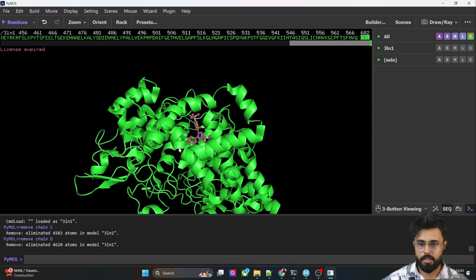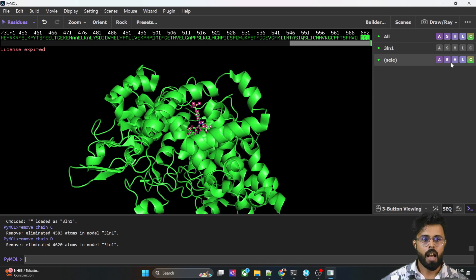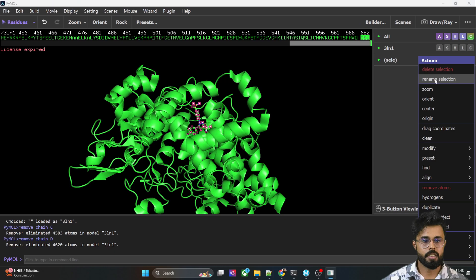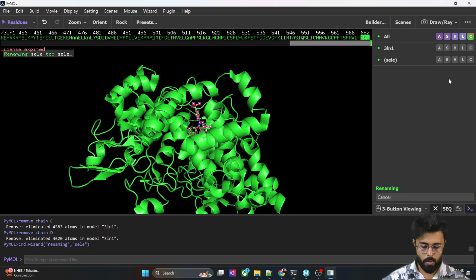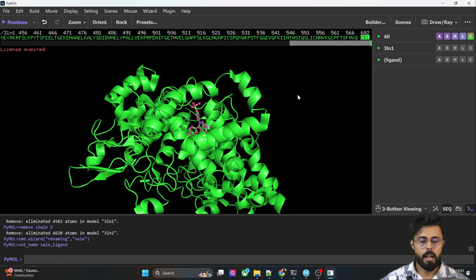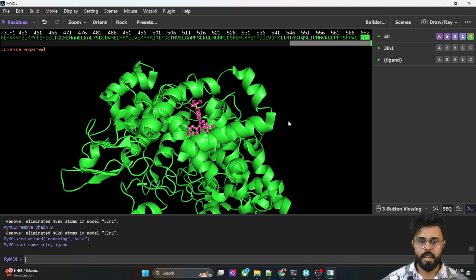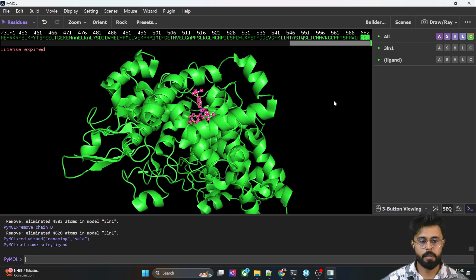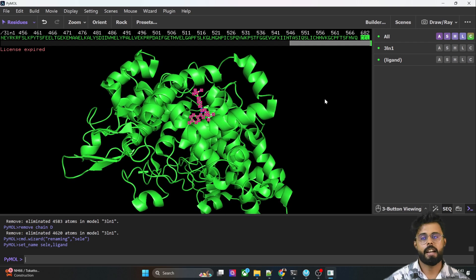I selected the ligand — you can see it is selected. In the selection option, we can go to the action option and change the name. I am going to change the name to 'ligand'. Now what we have to do is find the active sites around this particular ligand.